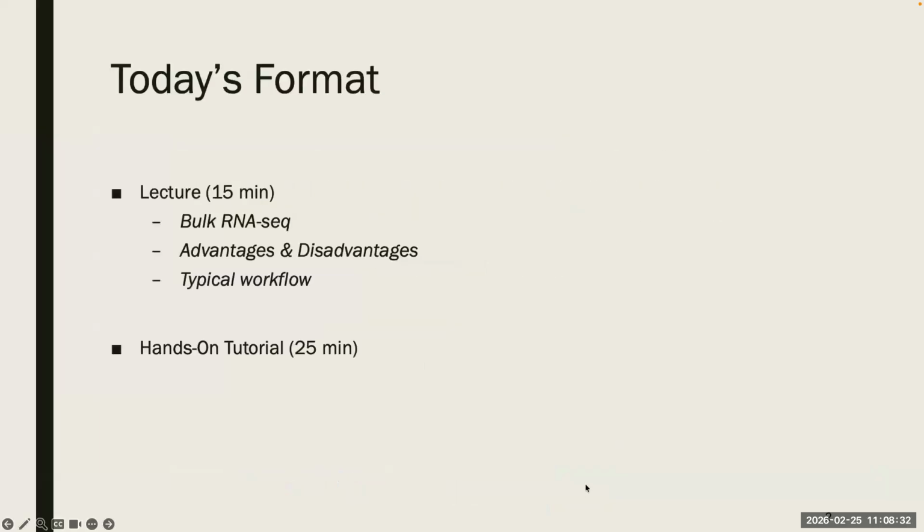Yeah, so for today's lecture, I structured it into two parts. The first part would be a 15 minutes lecture and then followed by a 25 minutes hands-on tutorial. In the lecture, we will cover bulk RNA sequencing, its advantages and disadvantages, and the typical workflow for bulk RNA-seq.